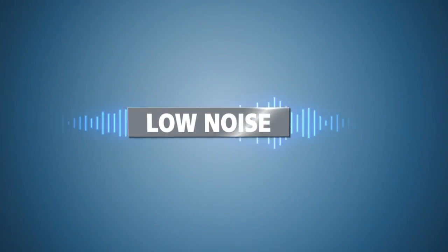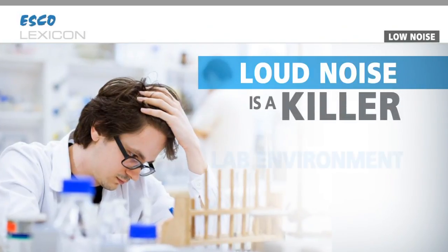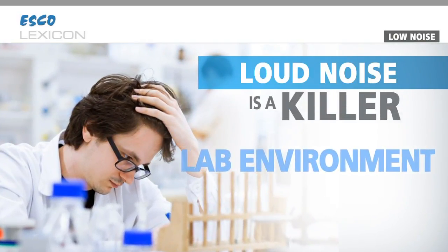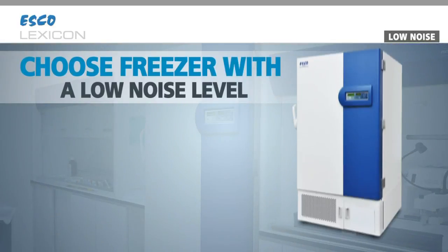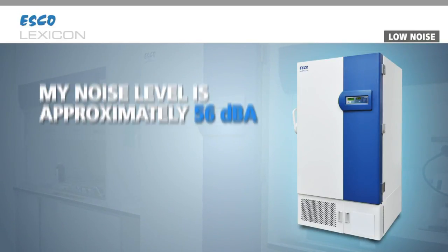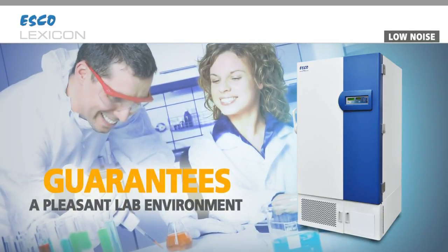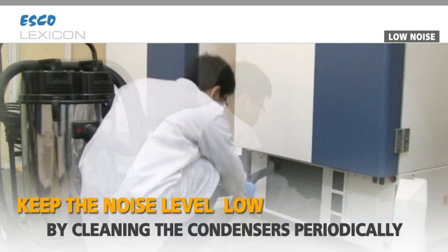Low noise. Loud noise is a killer in a quiet lab environment, which is very much needed for concentration. If you are placing the freezer in your lab and not in an isolated room, choose a freezer with a low noise level. I have a noise level of approximately 56 dBA, which guarantees a pleasant lab working environment. Keep the noise level low by cleaning the condensers at the bottom periodically.